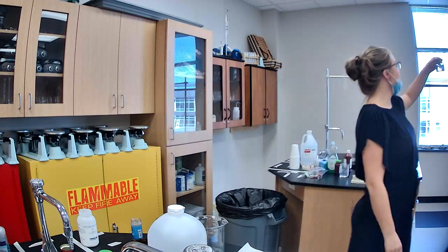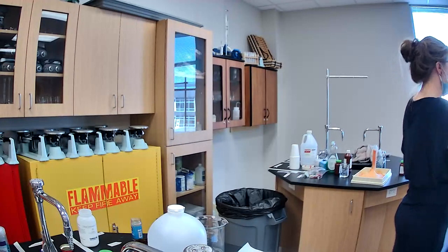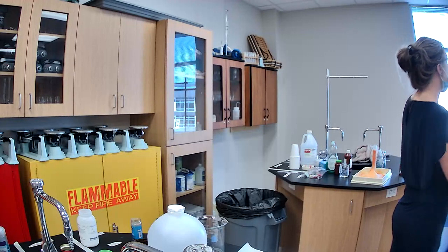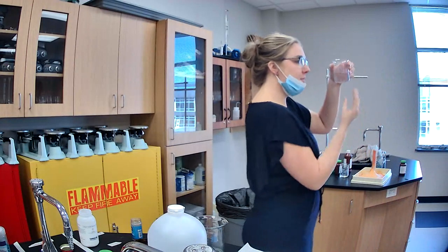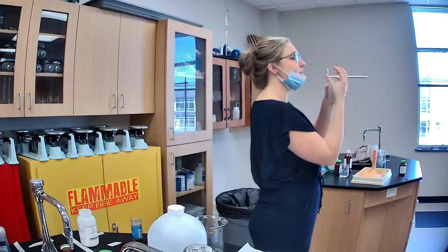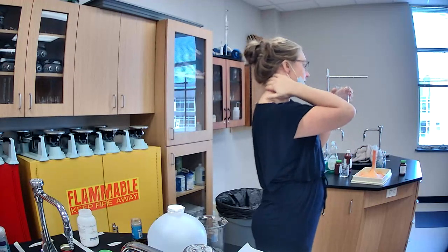I'm going to put it in here, but I'm never going to let the ink actually touch the water. Instead, the filter paper will actually draw the water up the filter paper and cause the ink to spread out. And hopefully we'll get to see all the different colors that are actually in the ink.